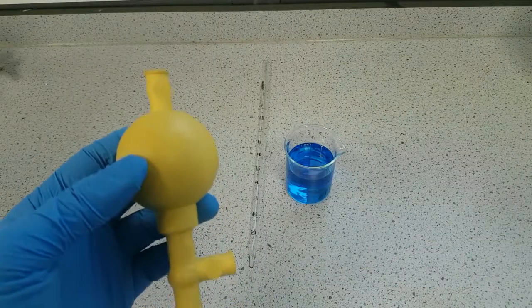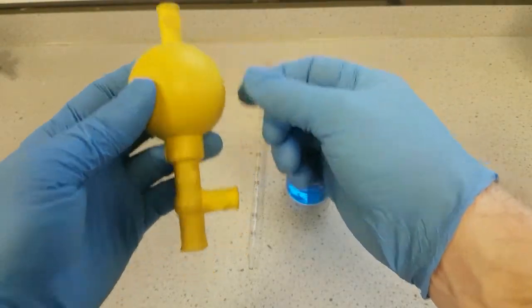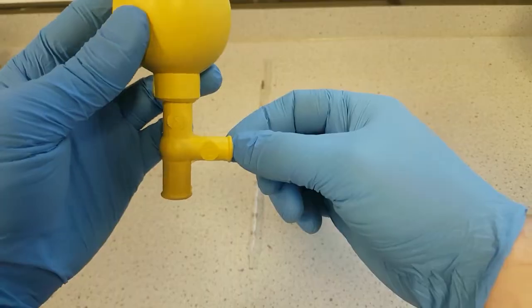In this video I'm going to quickly show you how to use a bulb pipette filler. This bulb pipette filler has three pressure valves: A, S and E.